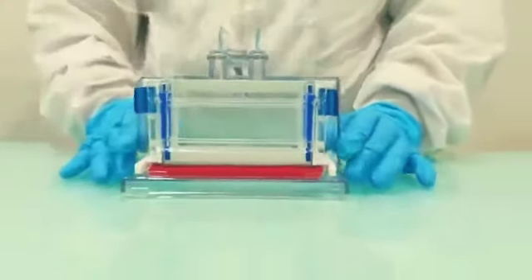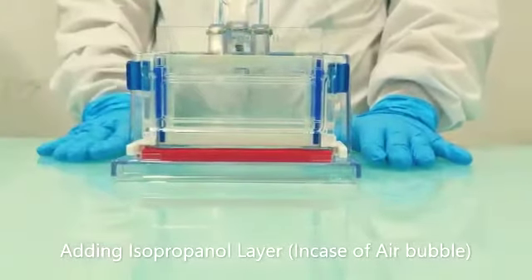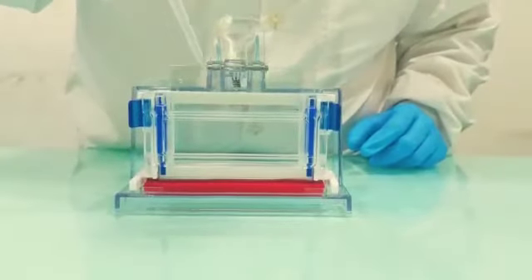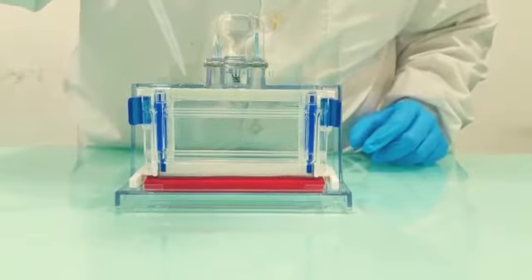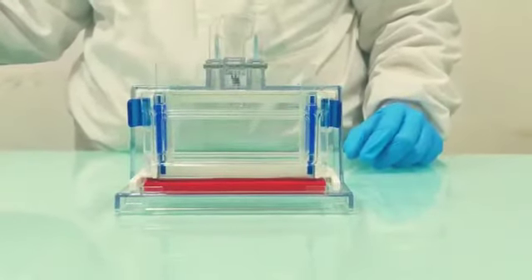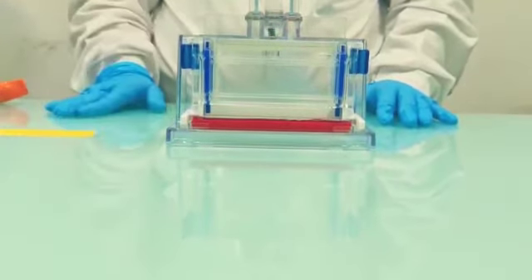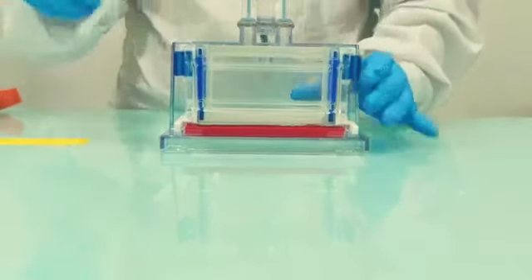In case air bubbles are formed, you can remove them by adding a layer of isopropanol, which also helps in leveling. Allow the gel to set for 20-30 minutes. After polymerization of the resolving gel, you can pour off the isopropanol from the sides.